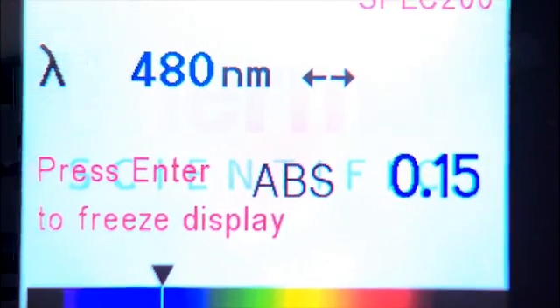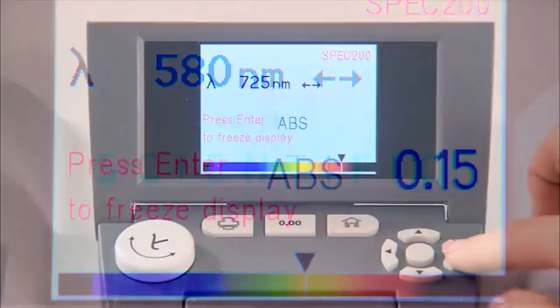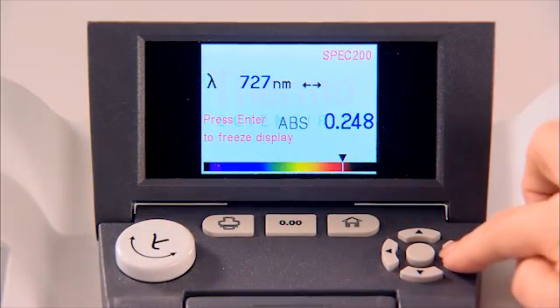The spectrum display helps students make the connection between numeric wavelength and the color of the light absorbed. You can also adjust wavelength with the keypad controls.